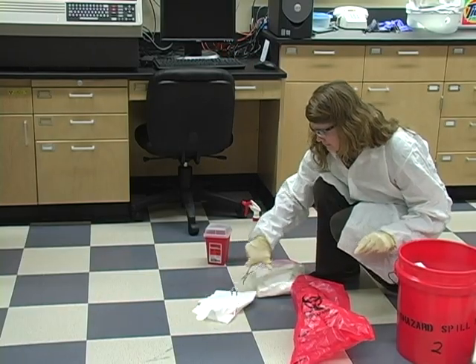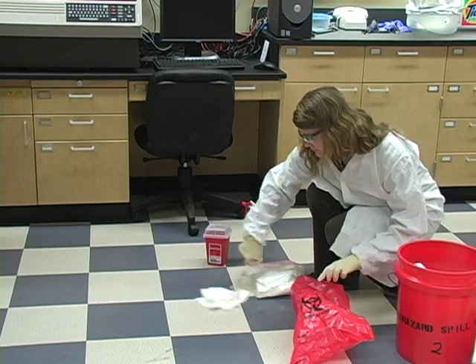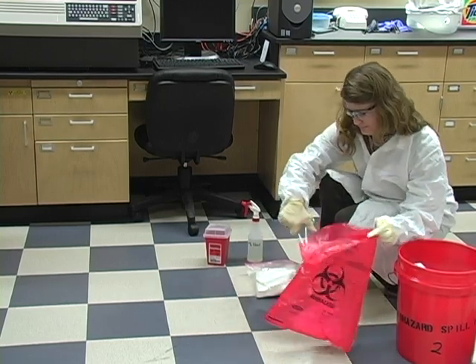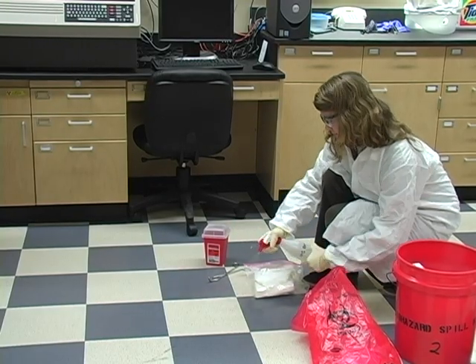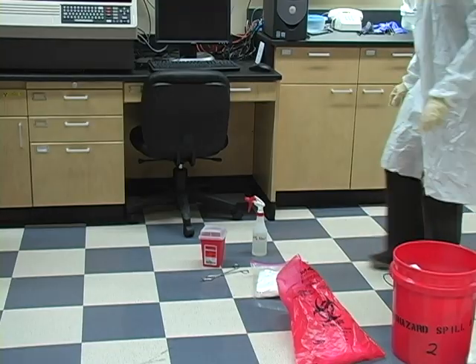Now wipe up the spill from the outside in. If sharps are present, use something other than your hands — smaller pieces may still be present even after larger pieces have been cleaned up. Repeat the above steps until no more material is left. Disinfect the spill area again and allow time for the disinfectant to work before wiping with paper towels one more time.